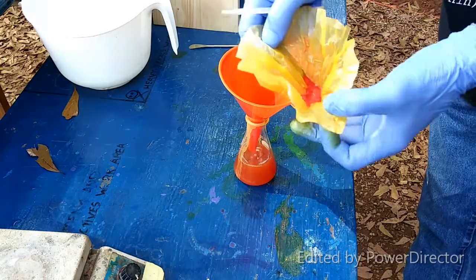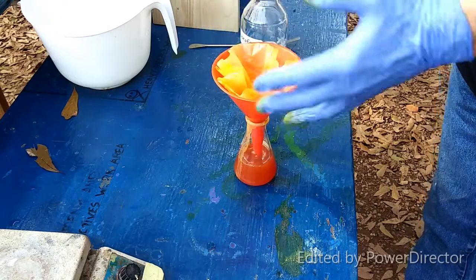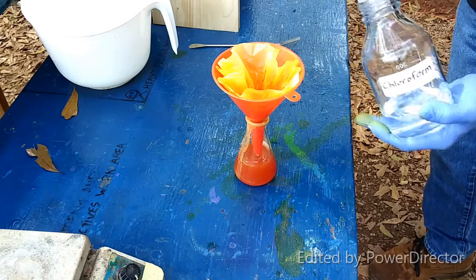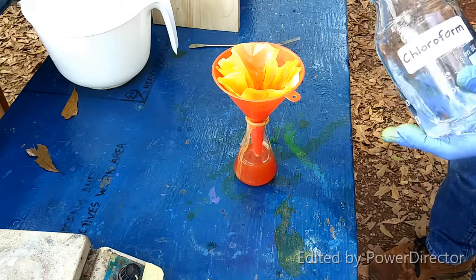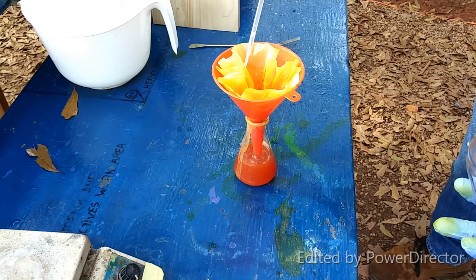Look at that jar. Isn't that pretty? Alright, here we go, man. Here comes the chloroform test. I don't want to change these damn gloves again. Come on, baby, don't dissolve.